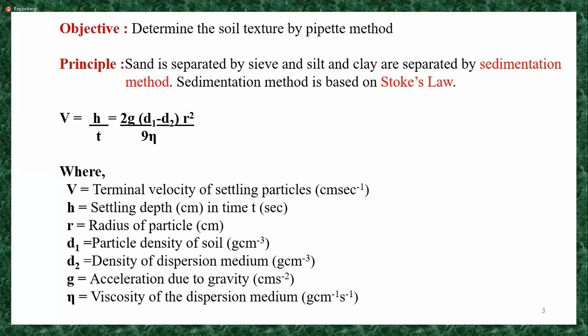Using this equation, we are going to determine the texture. We check the sedimentation time, and using it we can determine the proportion of sand, silt, and clay.